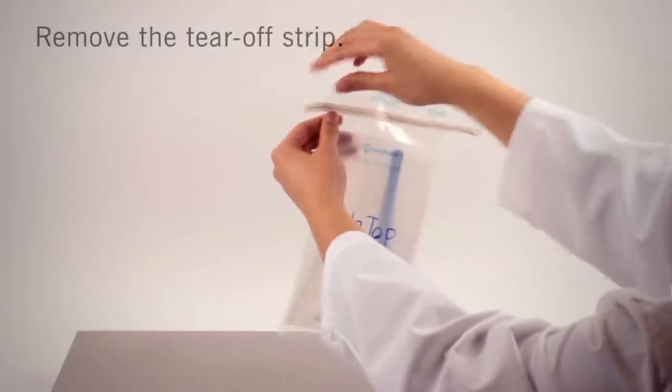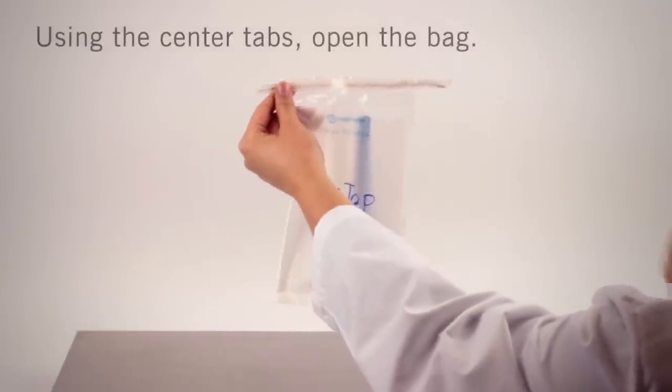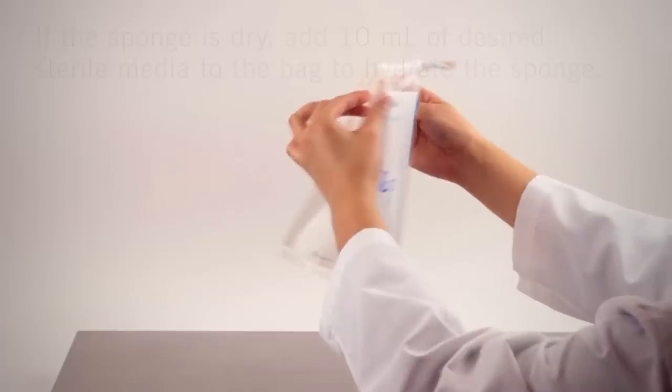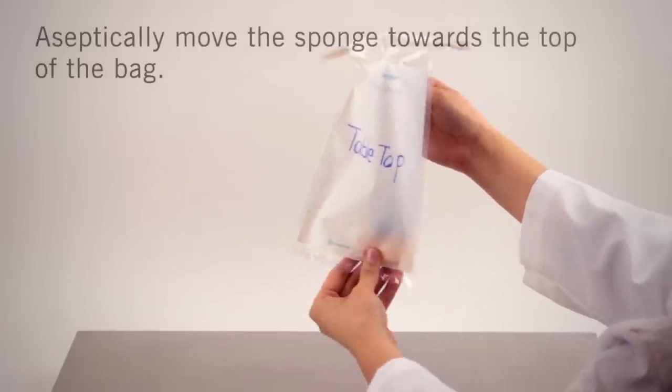Remove the tear-off strip. If stick sponge is ordered dry, add 10 milliliters of desired sterile media to the bag to hydrate the sponge. Hold the outside of the bag and guide the handle to the top of the bag.